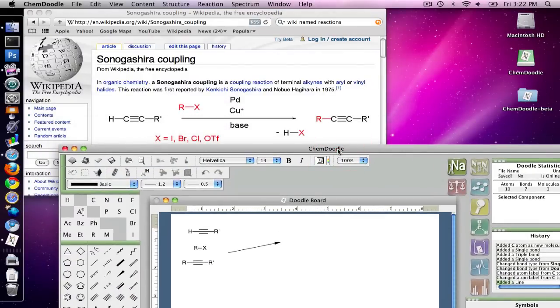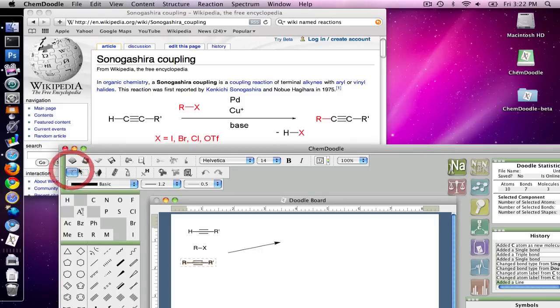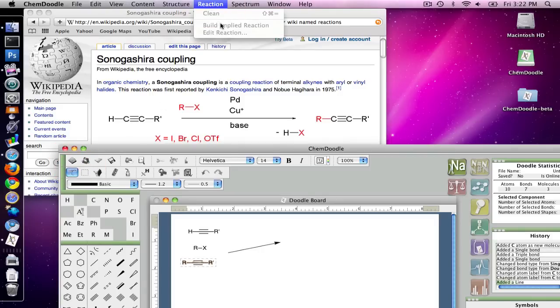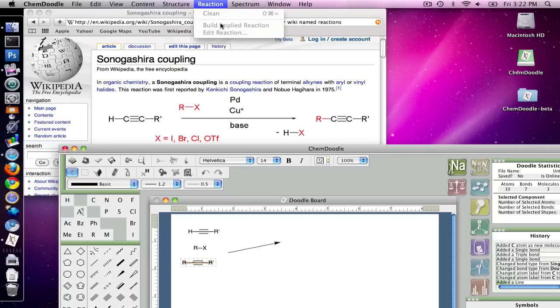Now I'm going to build the reaction together. We do have a function in the reaction menu called build implied reaction that will take the reactants and products and set it to the reaction based on how they're oriented around the arrow, but just in case you want a little bit more preciseness or you want to do more complex reaction schemes, you can manually edit the reaction.